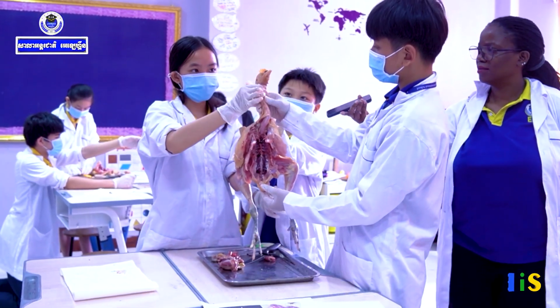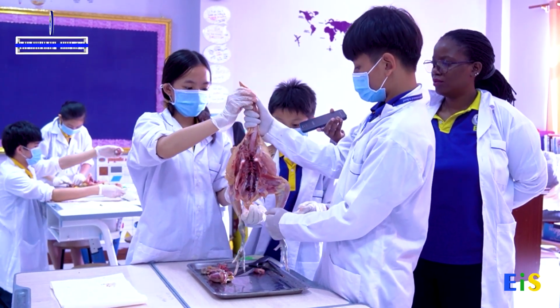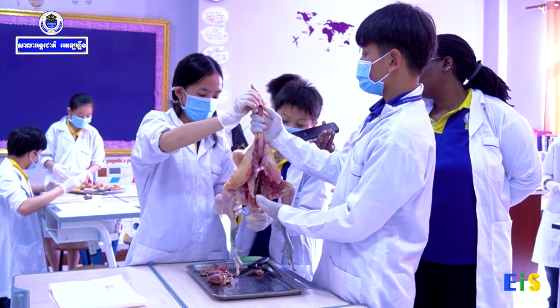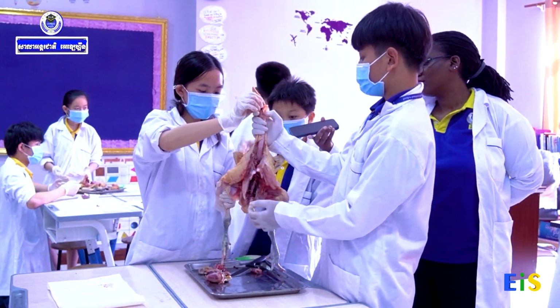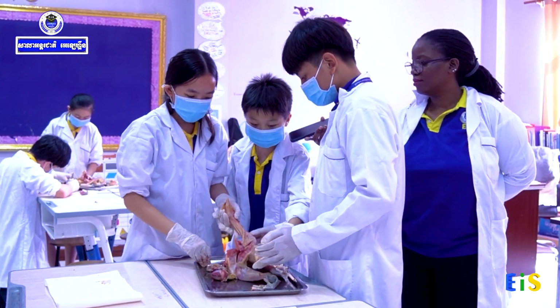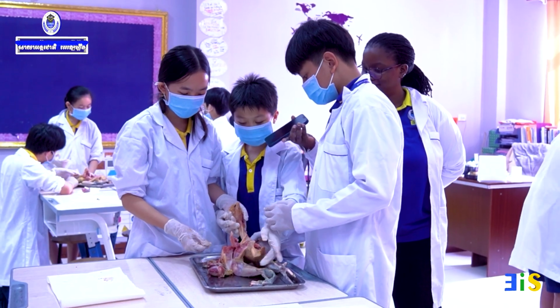This part is the eye, and this part is the brain, and this is the butt. This is the part where the chicken poops out its waste.